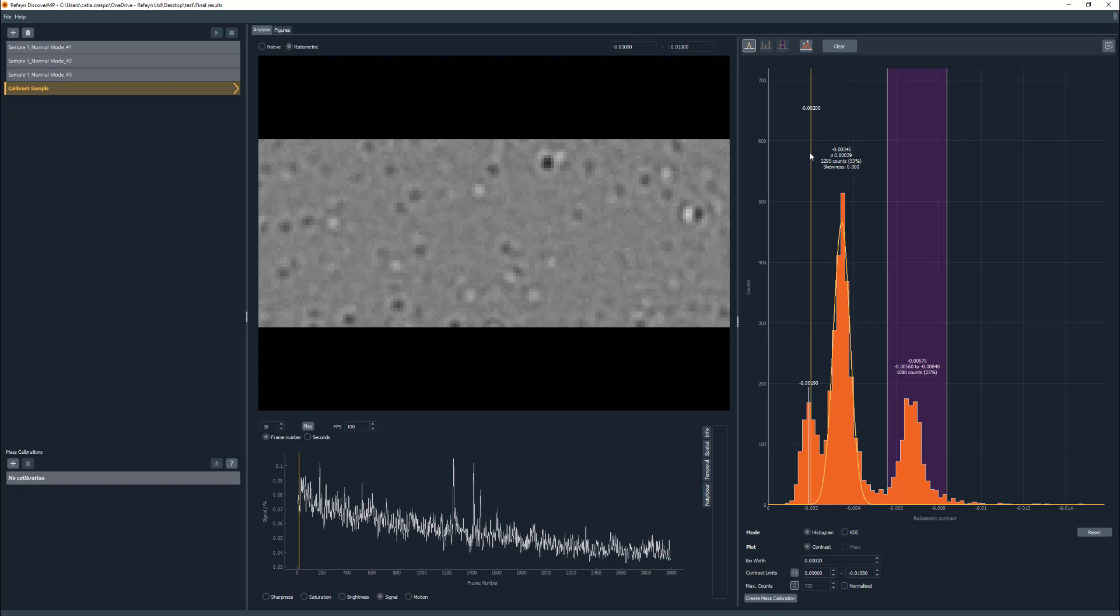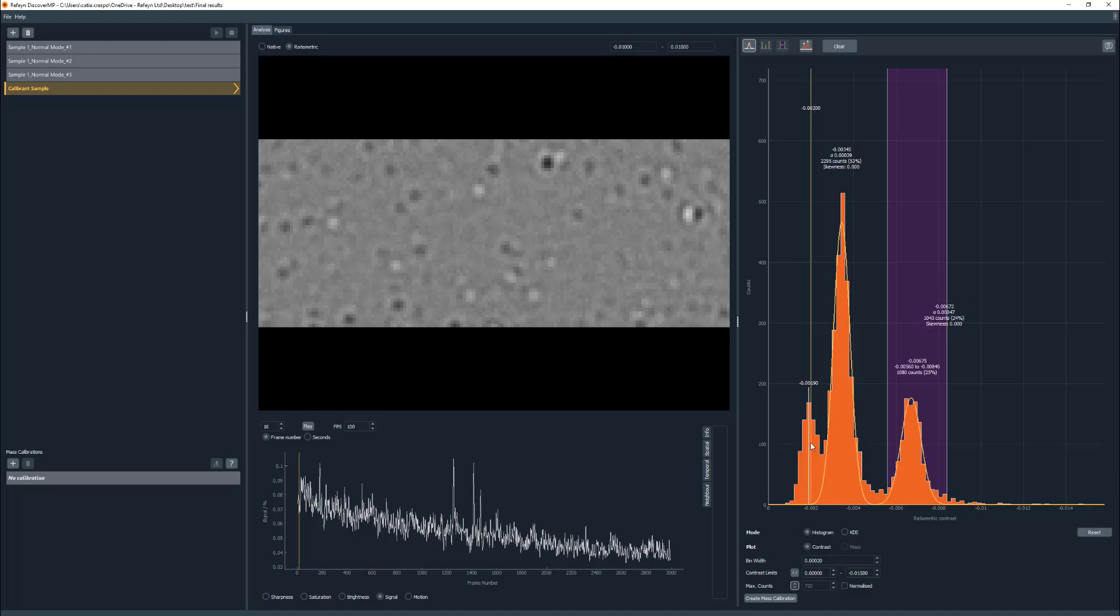The second way to fit the Gaussian is a double-click near the peak of interest. The software will then make a best guess for the Gaussian fit. This, as well as the automated peak fitting, is more reproducible and will fit the same peak each time and not depend on the interval selected.